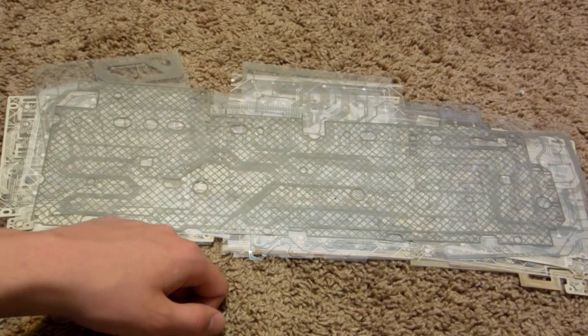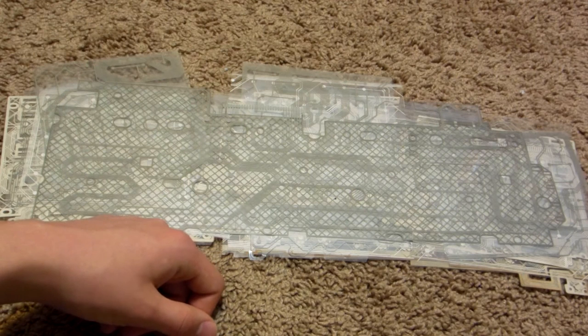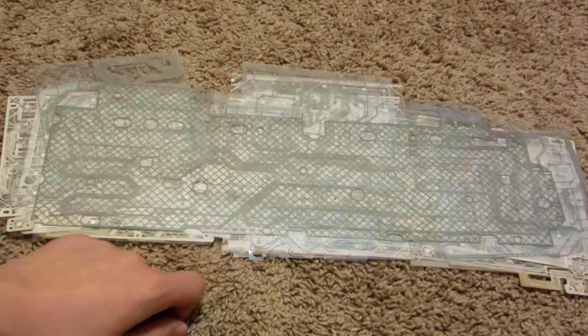So basically, the first thing I want to do is, whenever I start to collect these, and since I'm going to be processing them myself, I need to be sure that I have all proper safety equipment, like fume hoods and other various equipment, like personal protective equipment.